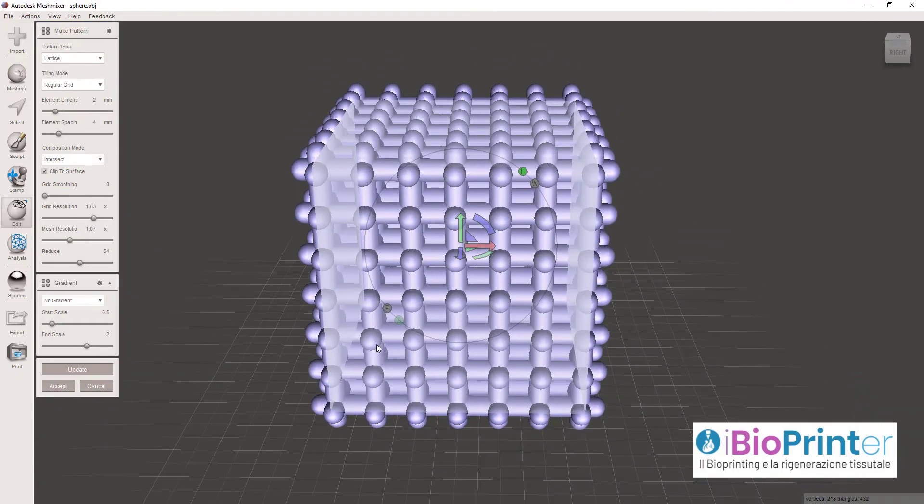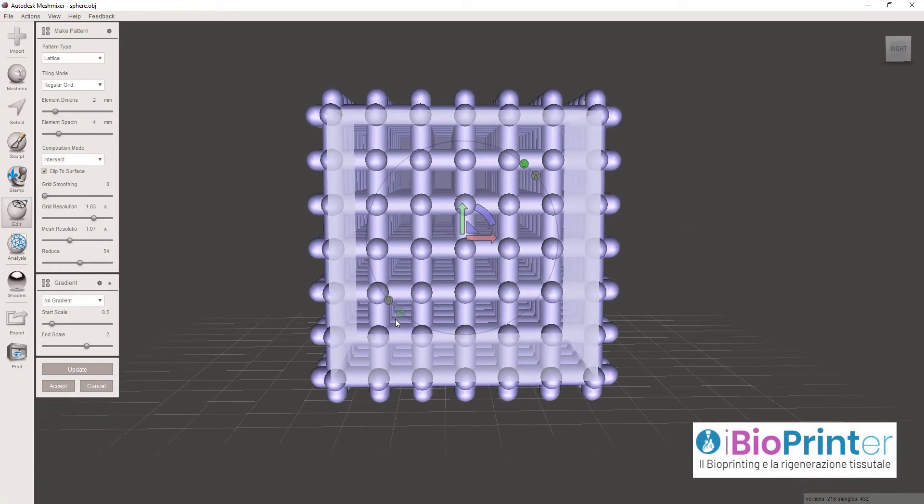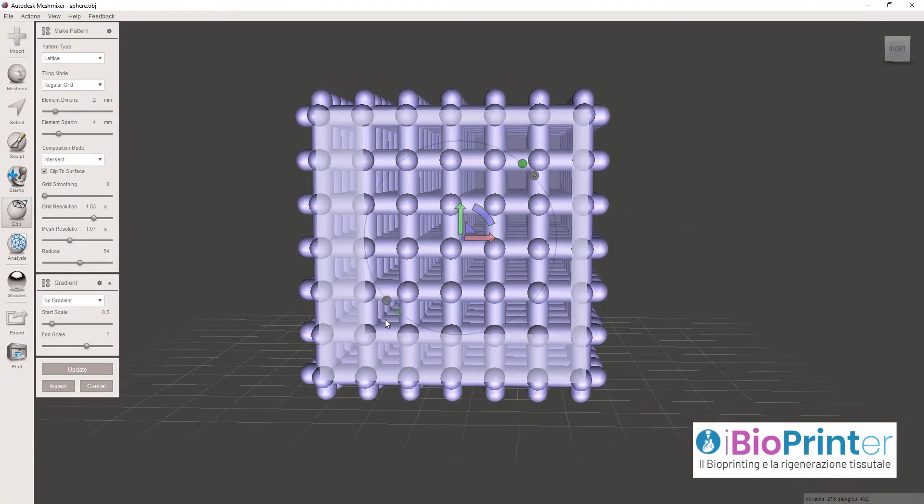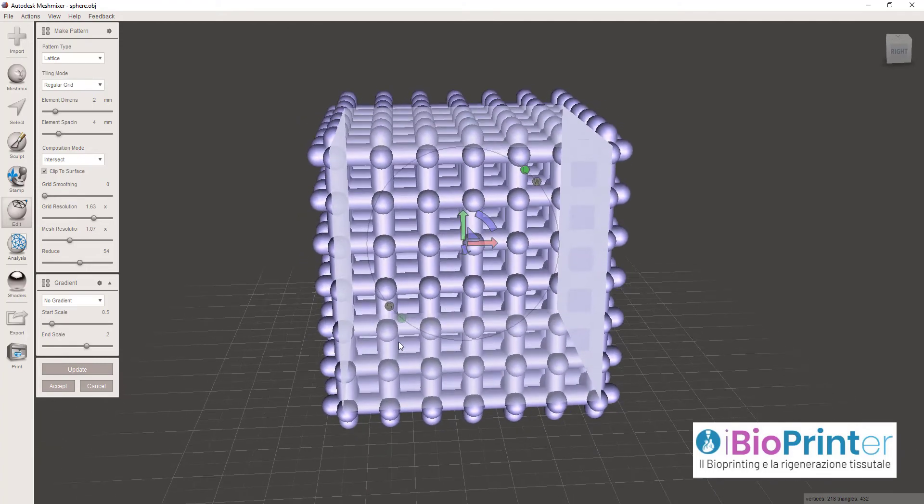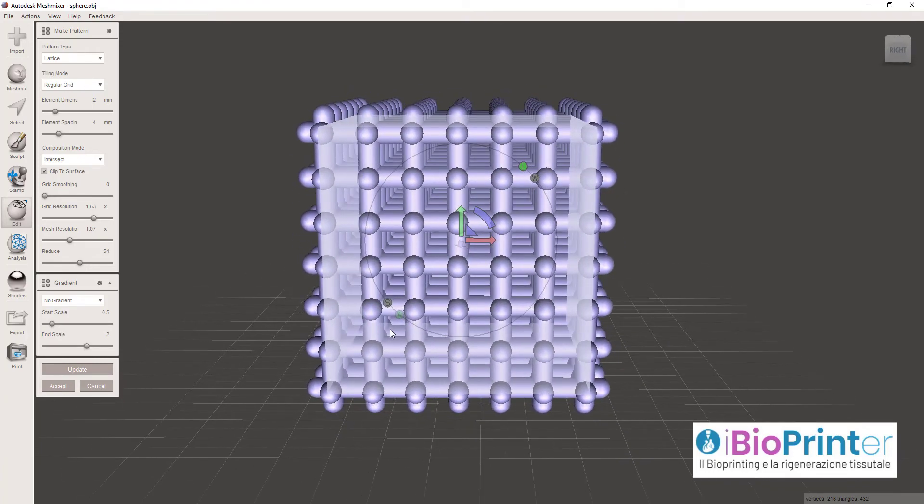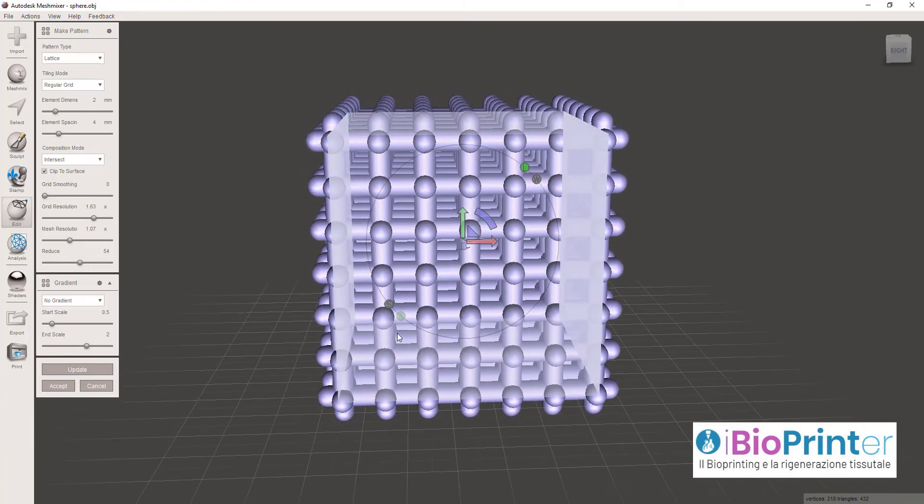Una cosa molto interessante, soprattutto per la possibilità di stampare questi scaffold con tecnica bioprinting, è sicuramente il gradiente.